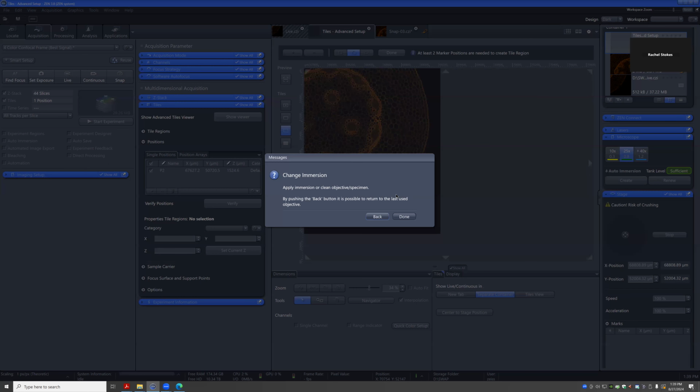You could technically switch it over. It's basically a little belt that sits around the objective. So you have to uncouple it. But you also have to tell the software that it's now set up on here, because otherwise it won't show you these.